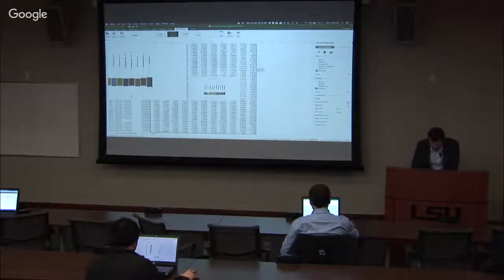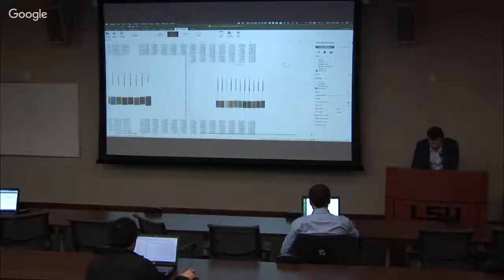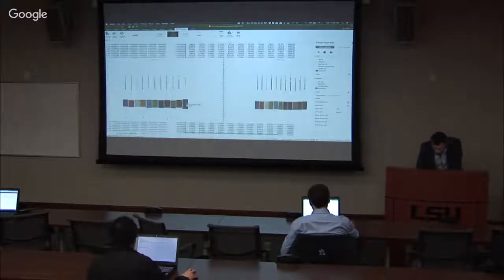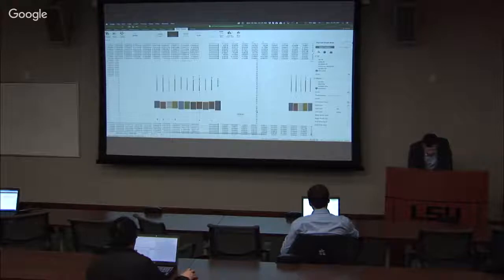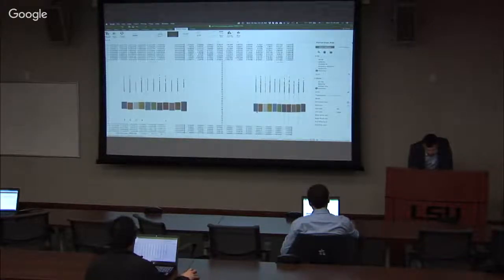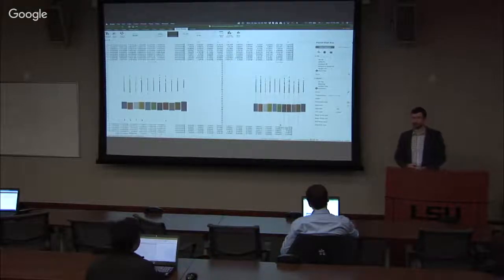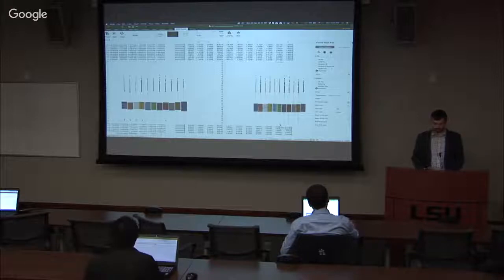As you remember, we didn't have to do the logarithmic scale in Excel. We just did it within quantile normalization itself. What you can see is that we gave it a threshold, so it's not perfectly aligned, but it's much more aligned between them, and it's similar to logarithmic scale, but not exactly. If we take a look at how these top ends are aligned, they're not aligned here at all, and here they are aligned. At the bottom, you have a lot more outliers. So it really adds an additional layer of alignment between these, and so we can start looking at them as more representative of replicates.